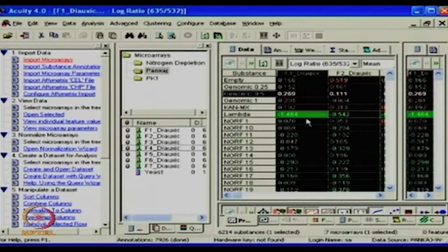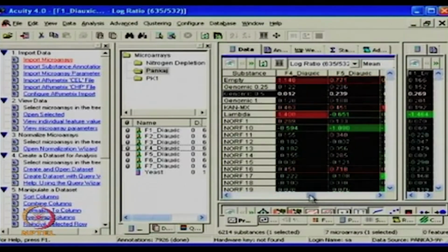The idea with this is which laser is being used for what. So in context, we have shown which kind of ratio you are using to check. Usually it is case over control that people report. Yeah. Right? So in this fashion, conventionally you can see the colors, but here there are many ones. There are many which we have opened now, 6.